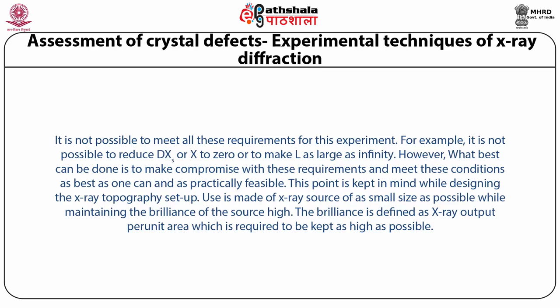However, what best can be done is to make a compromise with these requirements and meet these conditions as best as one can and as practically feasible. This point is kept in mind while designing the X-ray topography setup. Use is made of an X-ray source of as small a size as possible while maintaining the brilliance of the source high.